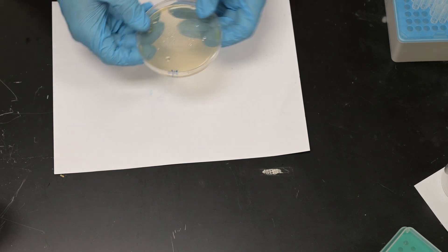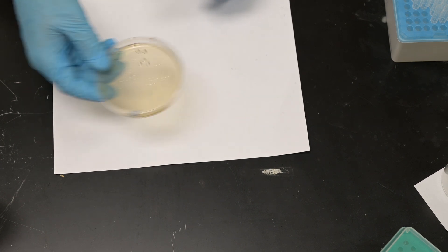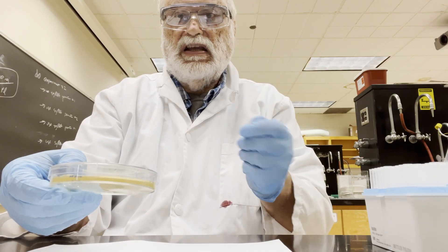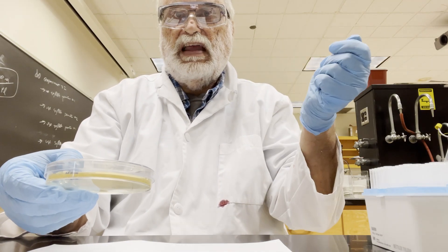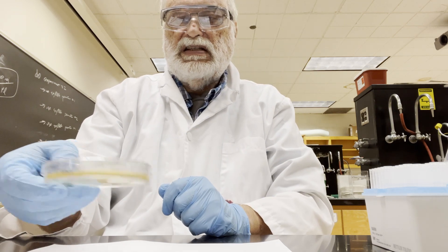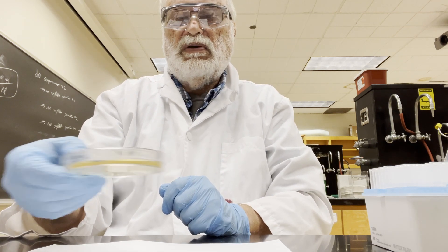The nice advantage is that if you use the technique you might have used in microbiology, you used a hockey stick — you might have put that in alcohol, then flamed it, had to cool it down, and then done this. To me, this technique seems a little bit easier and more straightforward.